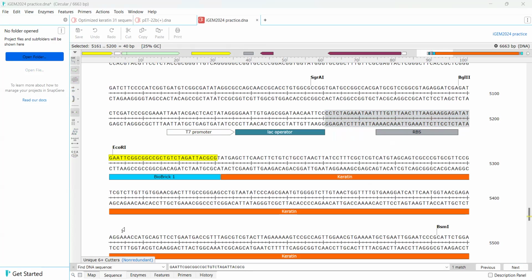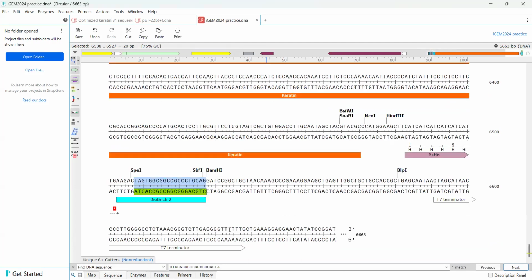For that, we need the reverse primer for keratin, which will be here. Let's see where the extension starts. Your extension will go here, but this time the extension gets to be reverse. I remember that this was kind of, let's see, where did we have this?